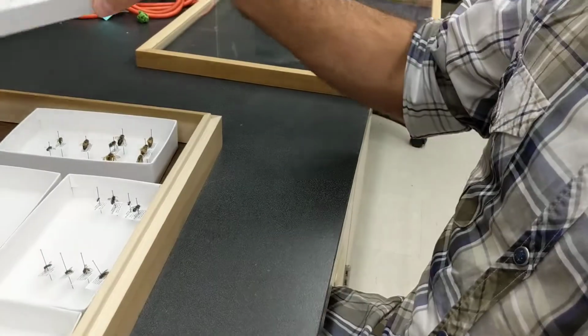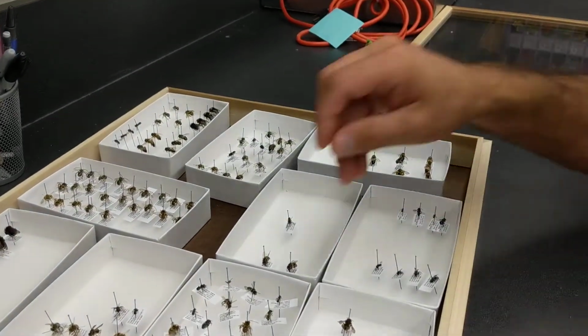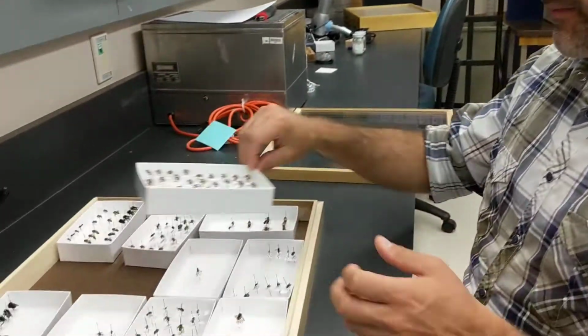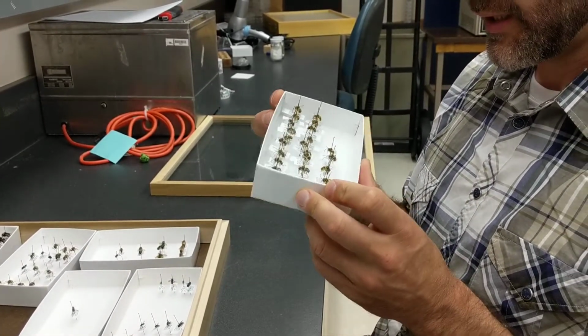So there we go. We've got a whole bunch of our longhorn bees sorted out. So would you sort those to those two color types? I wouldn't, because I suspect they're all the same. But for sure, if you're just learning, you could try and separate them by color. You could look for other characters under the microscope if you wanted.